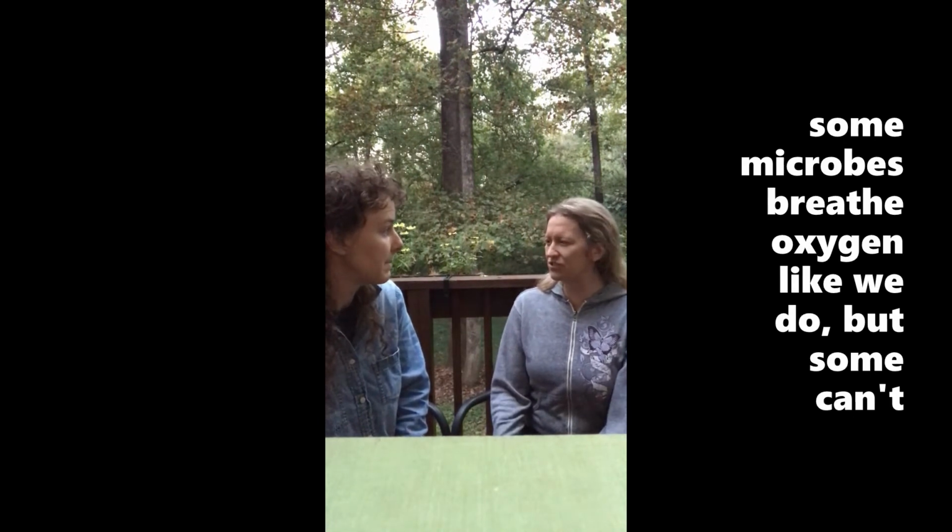So what do I need to do? I need to get some microbes. Where do I get microbes? A great way to find a bunch of interesting soil microbes is to go to a stream and get some mud from the bed, stick it in a jar. All right, I'm going to do it. All right, stay tuned.